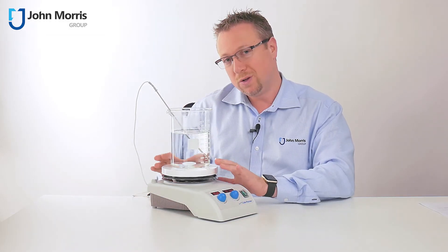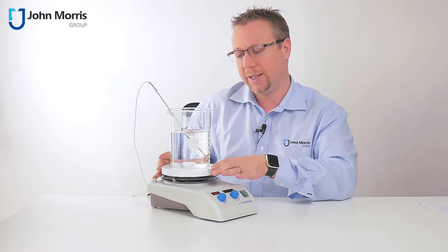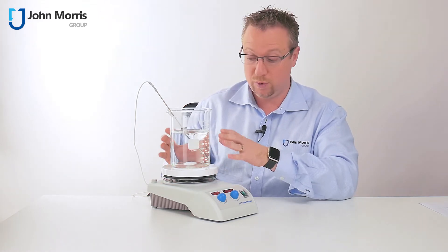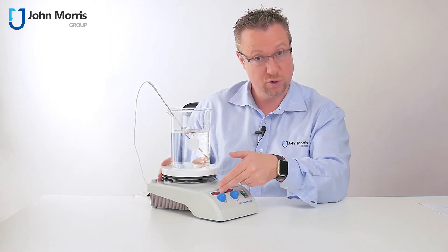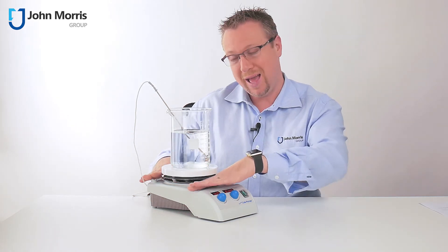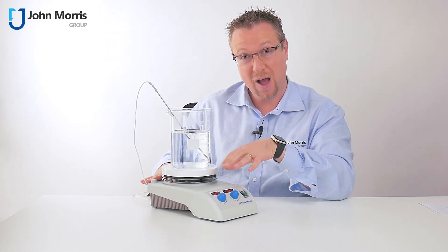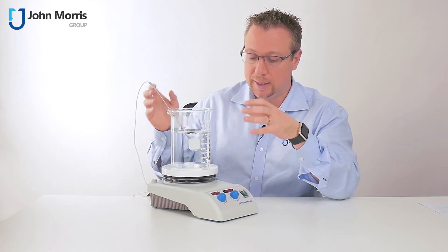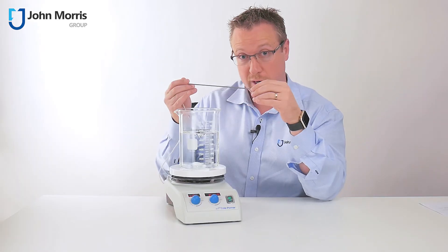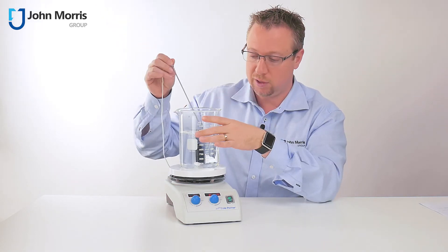From a John Morris perspective, we almost always have these units in stock, so they're always ready to go. We sell a ton of these. It's not that we don't have better hotplate magnetic stirrers — if you're after the premium end of the market, we certainly have that as well. But at $800, it's really hard to find a better package, particularly when it tells you when you're hot, it tells you the speed that you're running at, and it's quite well protected against spills. In a moment, we're going to do a test on this unit. You can also calibrate this PT100 sensor against a reference electrode, which is great because it means you know you're getting precision and accuracy from the entire unit.